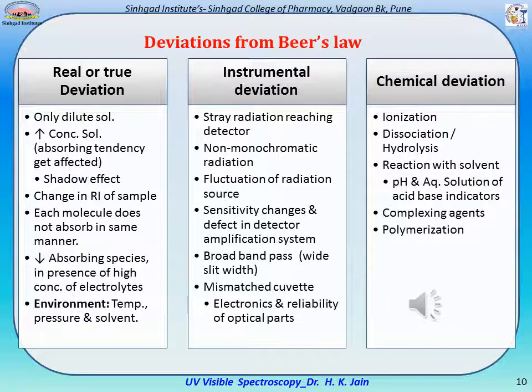Instrumental deviation involves stray radiation, non-monochromaticity of radiation, fluctuation of the radiation source, defects in the detector amplification system, broadband or wide slit width, mismatched cuvettes, and electronics and reliability of optical parts. Chemical deviations are due to ionization, dissociation, hydrolysis, reaction with solvent, effect of pH, complexing agents, and polymerization.